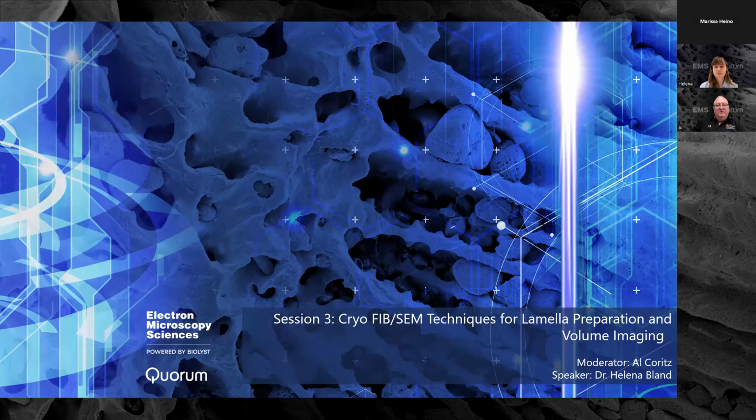Electron Microscopy Sciences and Quorum Technologies together have many decades of excellence in sample preparation. Today, we present the third in our series of webinars examining 3 distinct sample preparation workflows for electron microscopy. Today's tutorial, presented by Dr. Helena Bland, is about cryo-FIB-SEM techniques for lamella preparation and volume imaging.